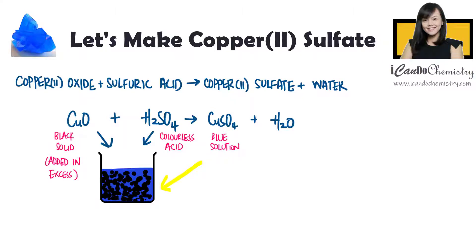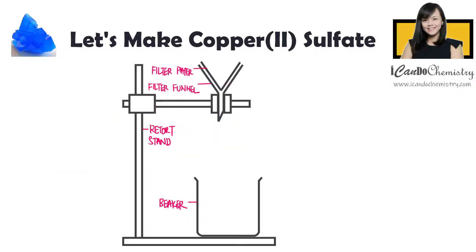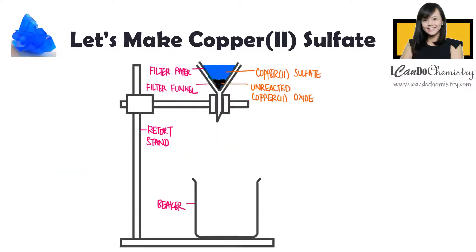This black mixture that you see here contains copper-2-sulfate solution and unreacted copper-2-oxide. To obtain copper-2-sulfate solution, we will filter the mixture.